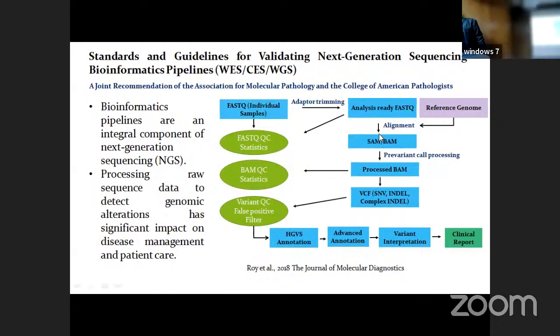So basically, after alignment, you get a Sequence Alignment Map file. Generally, if you have 10 GB of data, you will get 50 GB of alignment map file. Again, if you have one sample of 150 GB, you require 1 terabyte for analysis, right? The SAM file you cannot keep. If you keep it, it will definitely take all of your space.